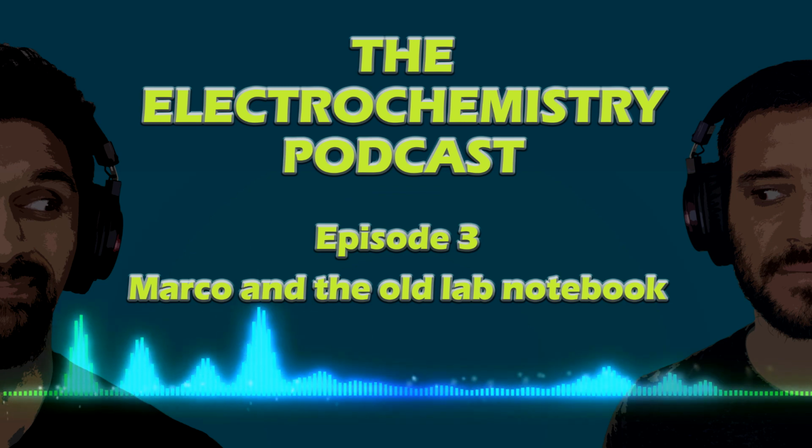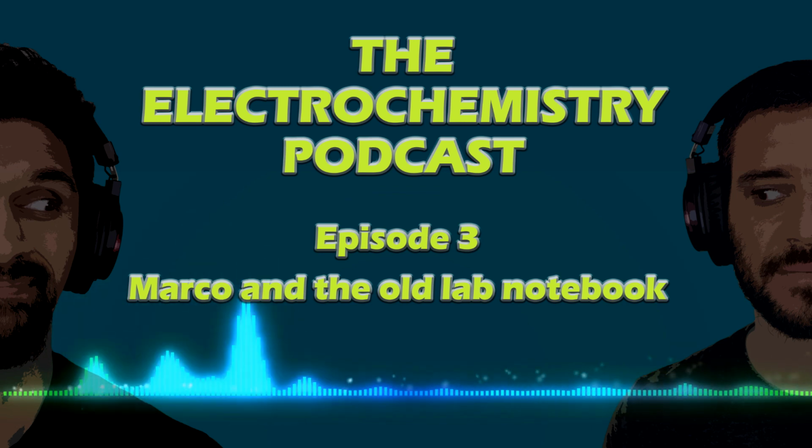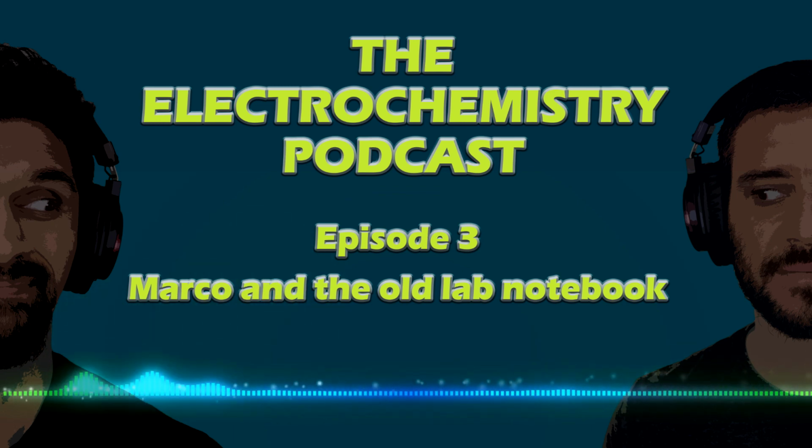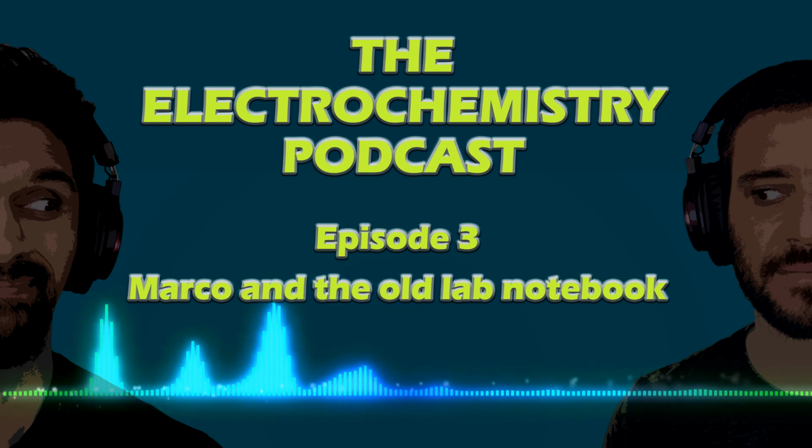Yeah, exactly. And I know Alex has made this analogy before with respect to a potentiostat circuit. I think we got a video on our YouTube channel about this, but it's a great one. So I'm just going to steal it and repeat it here. But you can think of this kind of thing with compliance voltage like driving a car. Okay, so in this case, let's say I'm driving a complete piece of garbage with 2 cylinders and half a busted engine, right? So I desperately want to go 60 miles per hour. So I floor the accelerator, but no matter how hard I press it, my awful car only hits 45 miles an hour.